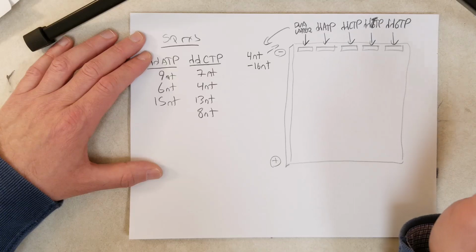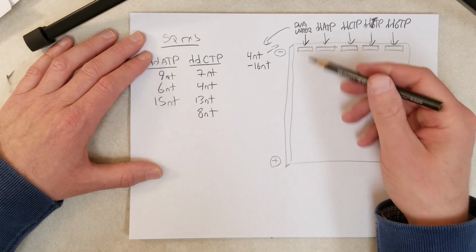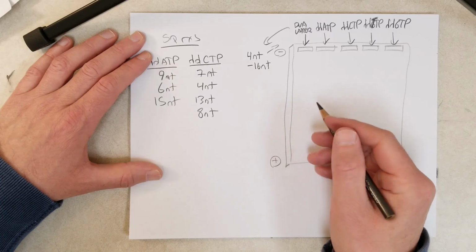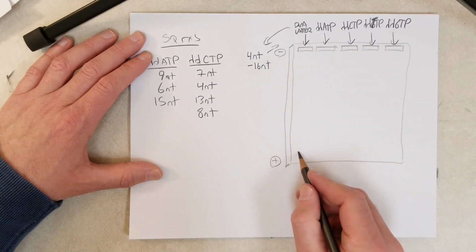So we're going to skip over all that, and we're just going to assume that now we ran the gel, and we know where the DNA is. We can see where the DNA molecules are. So let me put the ladder in first.